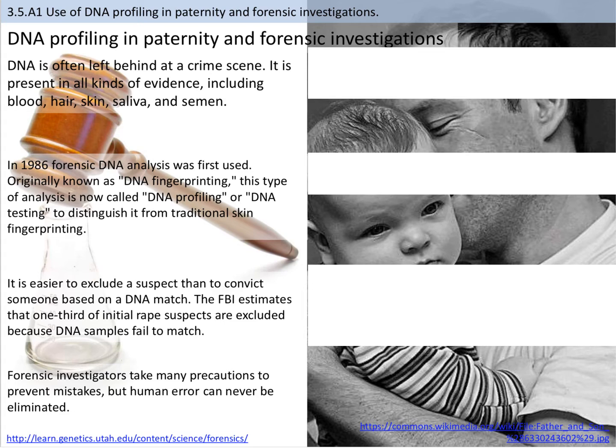Because again, we're dealing with something that's nanoscopic. It could very easily be that someone who's working with the DNA samples, their DNA accidentally gets into the samples that they're working with because they lost some skin cells, or, you know, they sneezed and so some of their cheek cells came out through the process of sneezing, and so it ended up in some of their samples.